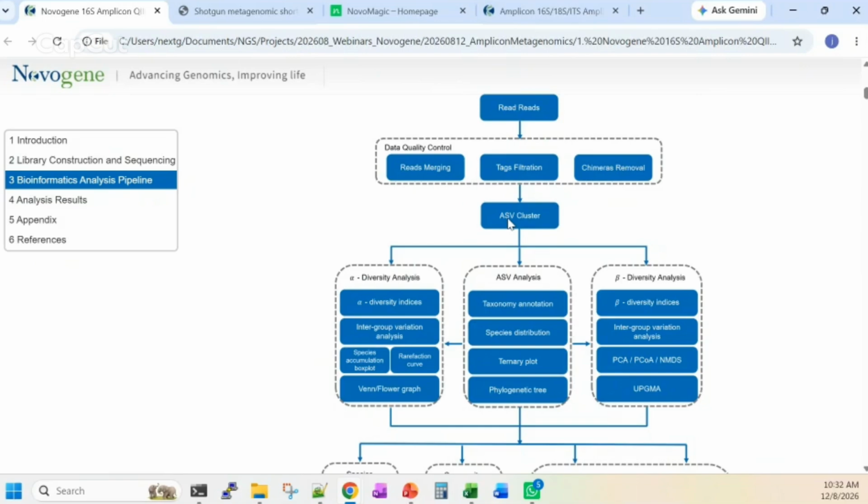Compared to the previous OTUs, OTUs were used to refer to sequences where, whenever we see sequences having 97% identity, we put them together as the same sequence cluster or same taxonomic unit, and we assume every taxonomic unit represents one species. But in situations where 97% identity is considered a single species, that is not so logical.